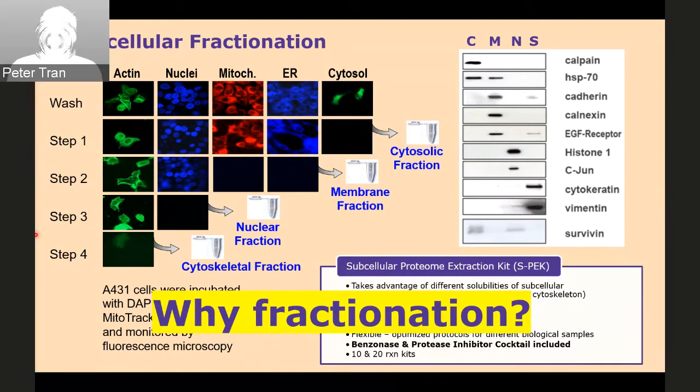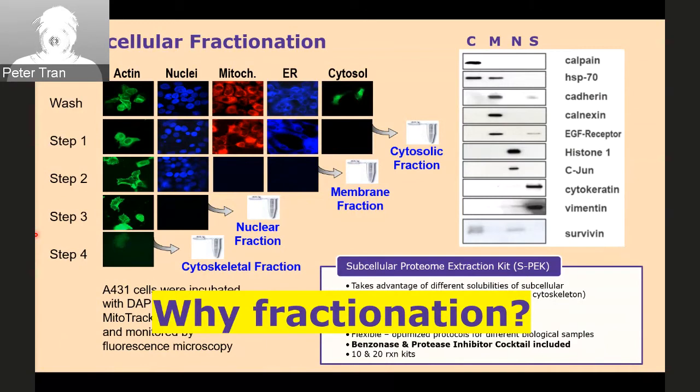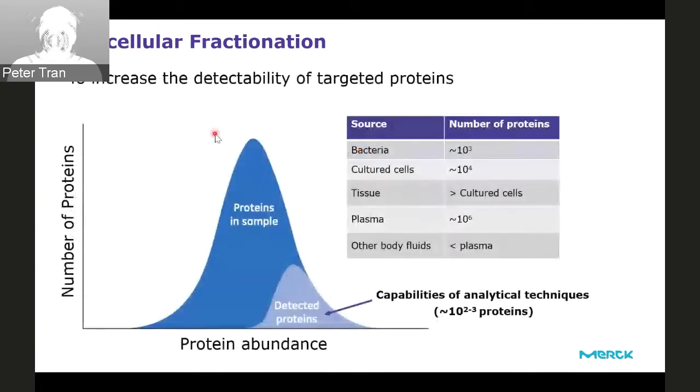Okay, so most of you chose to examine protein localization. Yes, that's the most common application. And most of you also chose to increase the detectability of the target protein. That's really good. That's what I wanted to know. Okay, going back to my presentation. So basically, what I want to emphasize here is that there's no right or wrong answer. I just want to emphasize that fractionation can increase the detectability of the target protein.